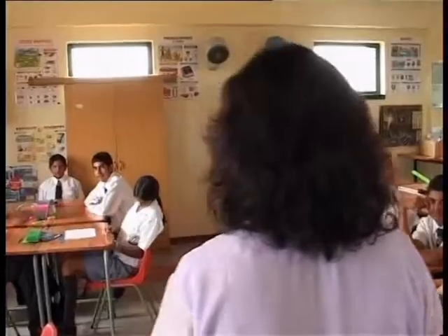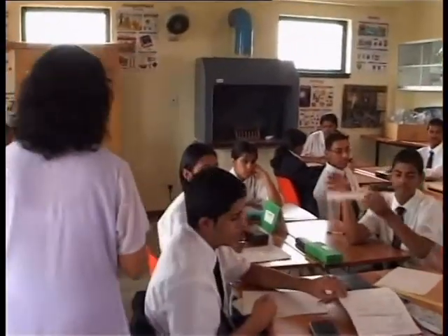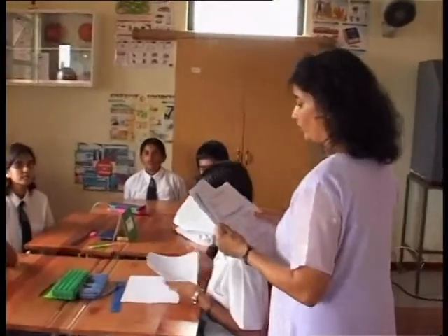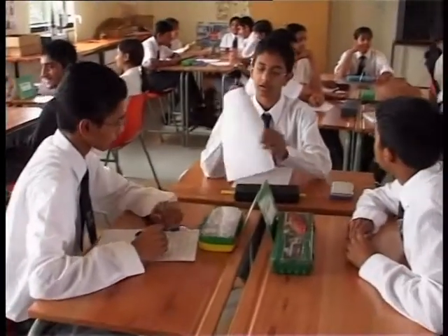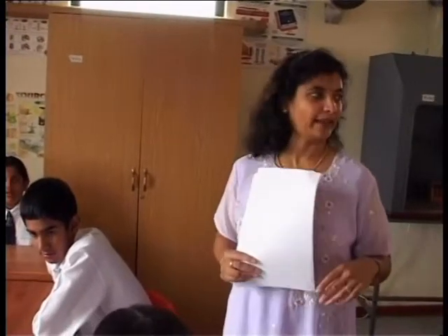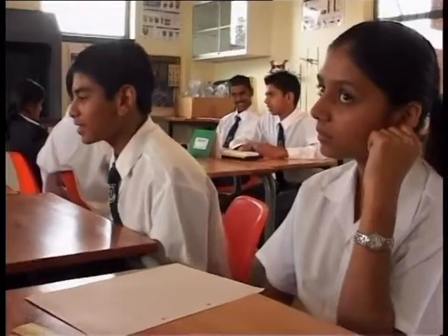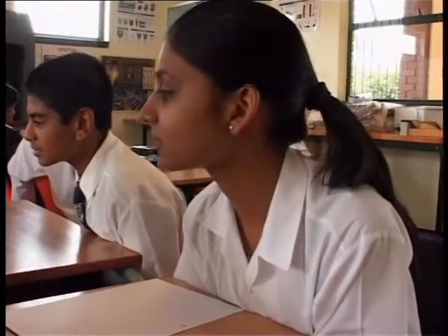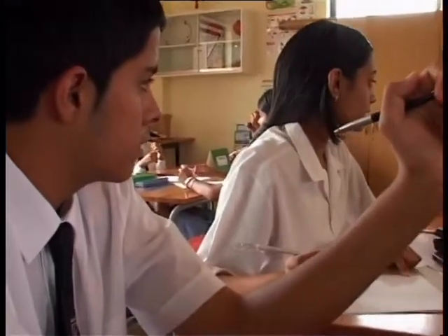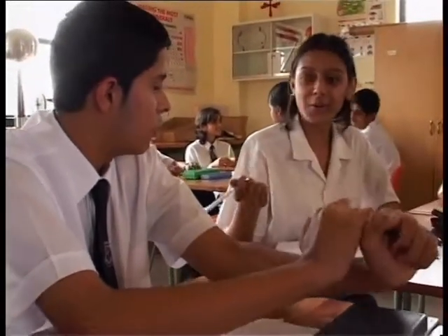Here's a worksheet to show you exactly how the 3 tests are going to be carried out. Giving only one worksheet to each group forces the learners to work together rather than on their own. Right, choose one learner in your group to be a reader, one learner in your group to collect the chemicals. By allocating responsibility, the teacher is ensuring that all learners in each group participate fully in the lesson. I'll take down the records.